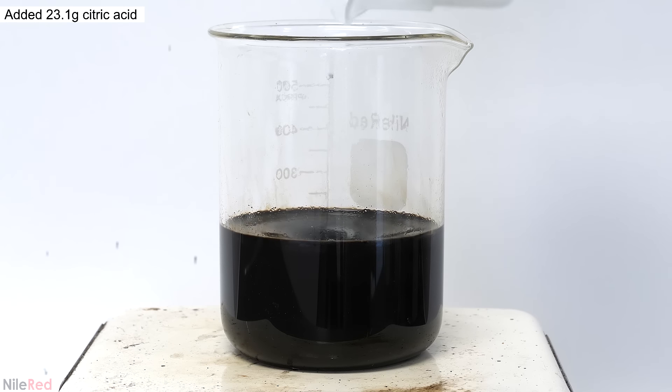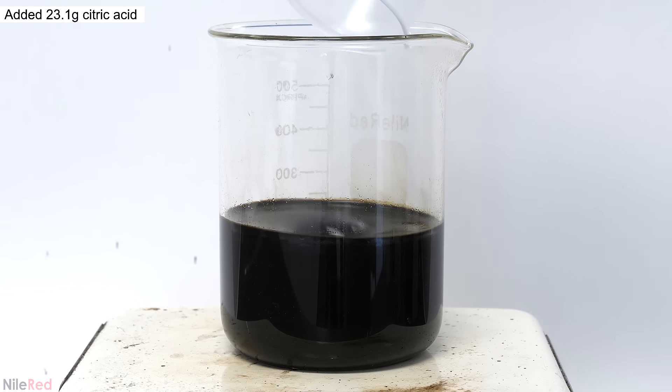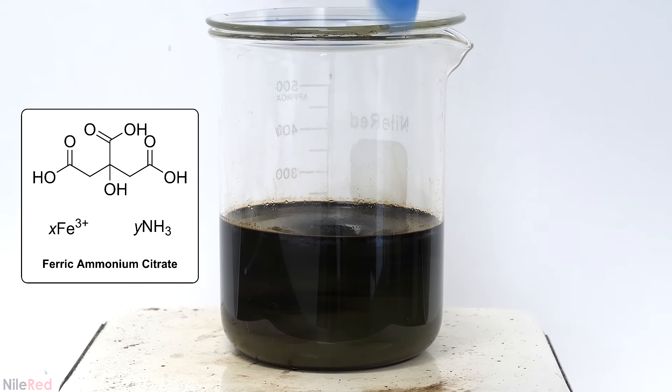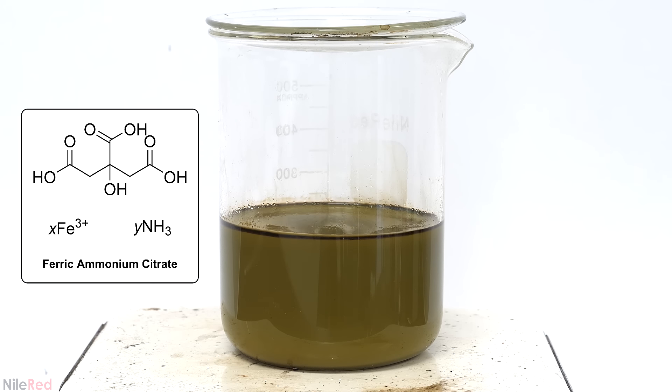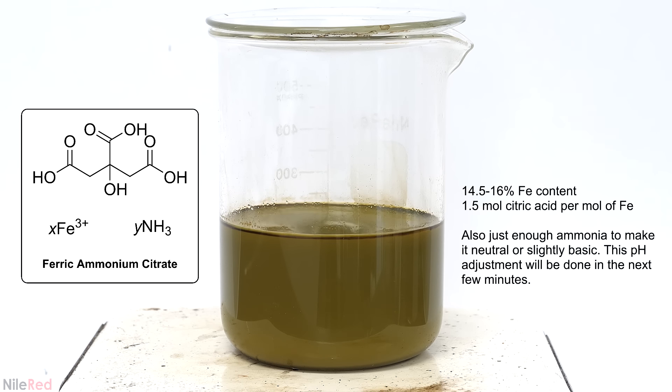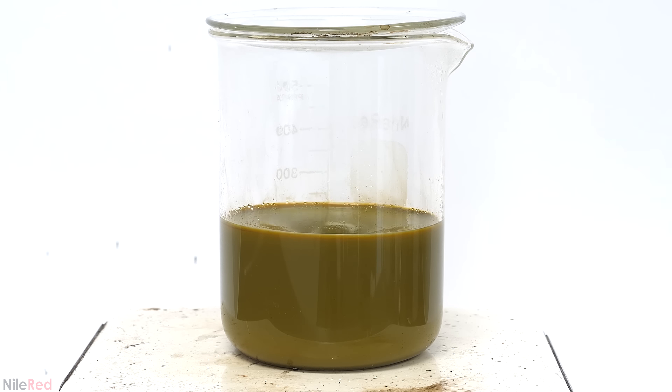After the 90 minutes, I dumped in another 23.1 grams of citric acid and a green precipitate appeared. I'm honestly not exactly sure what the precipitate was, but I know that in this step I was forming the final ferric ammonium citrate complex. The final composition of the ferric ammonium citrate can vary a lot, but this one should be between 14 and 16% iron and have about one and a half moles of citric acid for every mole of iron.